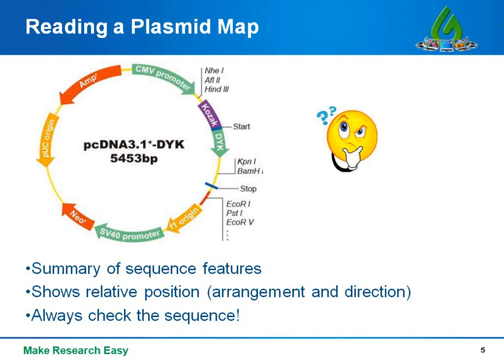Position within the plasmid is communicated by numbering each nucleotide, starting at the origin of replication. The ordering of components is critical in some places and not so much in others. For example, the location of antibiotic resistance genes like AMP and NEO shown on the map here are usually historic and not necessarily optimal. You can sometimes get better performance by moving these pieces around, but that's not often done. However, the position of open reading frames relative to the promoters that drive their expression is in fact critical.